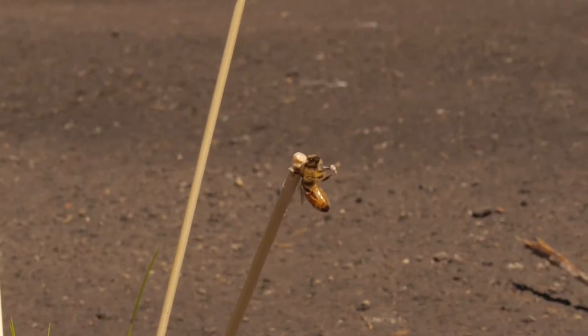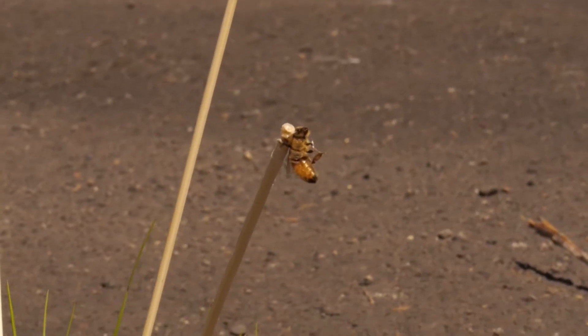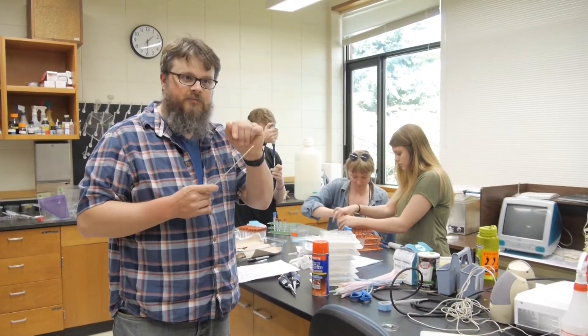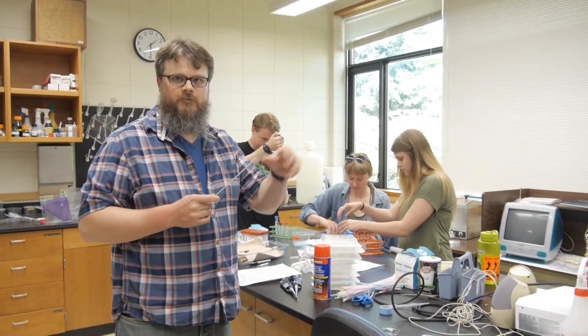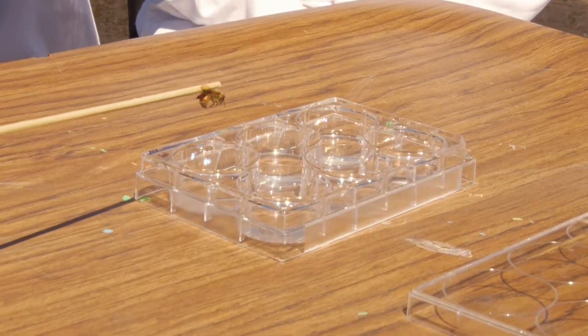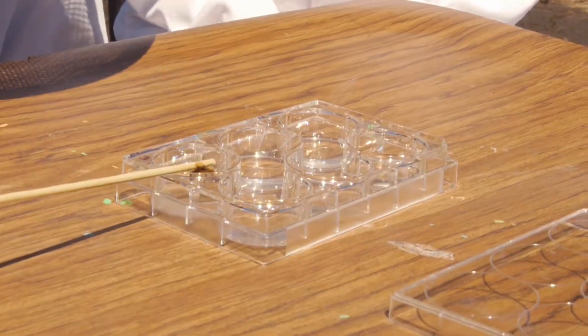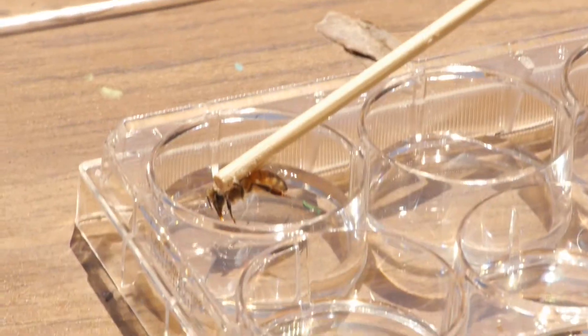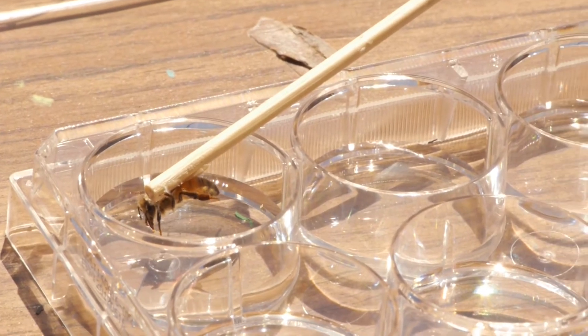Once the bee is on the stick, you can take it and do whatever you want with it. If you do it carefully, you can actually flick the bee off and it will detach from the glue and be fine — though whether it survives is sort of up to them. When you dip their feet in something that they think tastes sweet, their mouthparts come down and they start feeding from it.